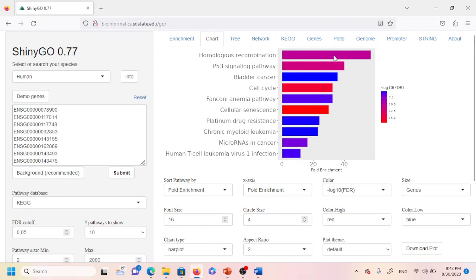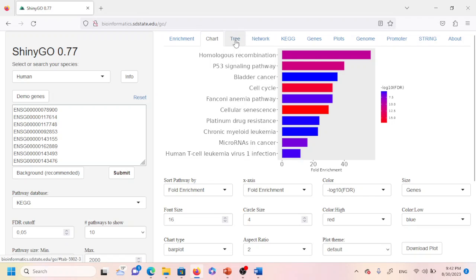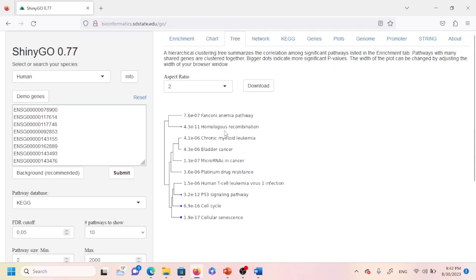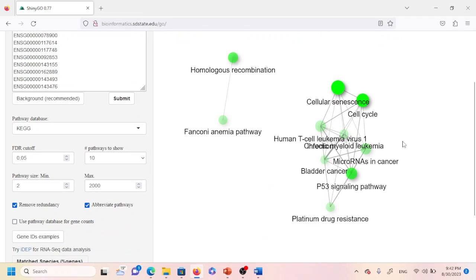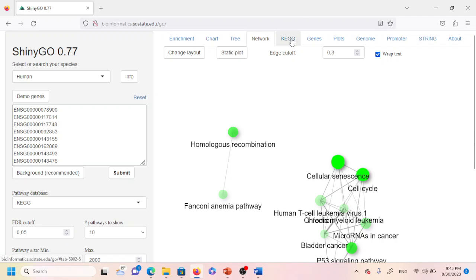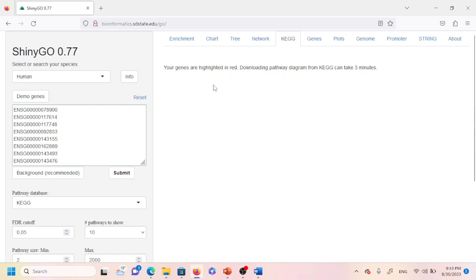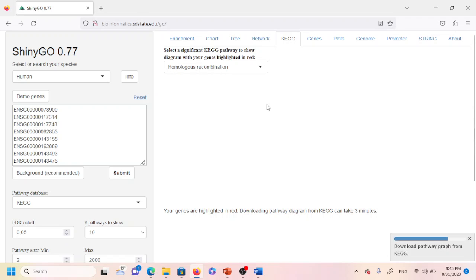To interpret this: when we submitted the list of genes we got this chart, meaning these pathways — homologous recombination, p53 signaling pathway, bladder cancer pathway, and so on — are enriched in our experimental gene set. If you want to visualize them as a tree, click on 'Tree' and you'll see the 10 pathways displayed as a tree. You can also click 'Network' to view them as a network. Clicking on 'KEGG' will highlight the genes in red in the pathway diagram, though downloading can take up to three minutes.